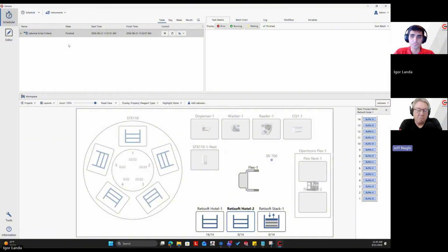And just as a highlight, that import Labware allows you to set the deck in just that case where we can export it and then bring it back in later for another run, or in this case, another demonstration of how things would work. So you decide where you want the Labware, export it, and then you can bring it back in later on. Really cool little tool. So you don't have to keep on adding Labware manually. You can just import it from here, and it's all set up for the next run.